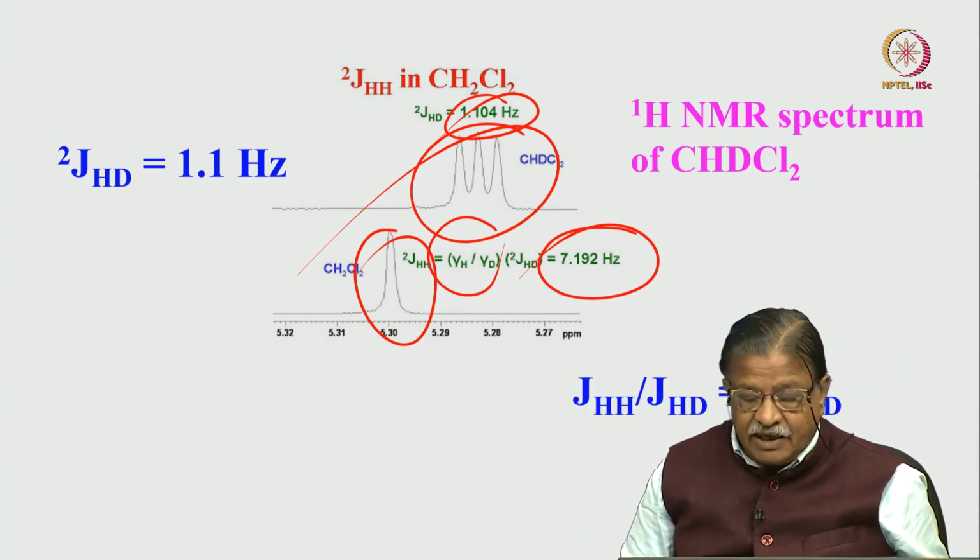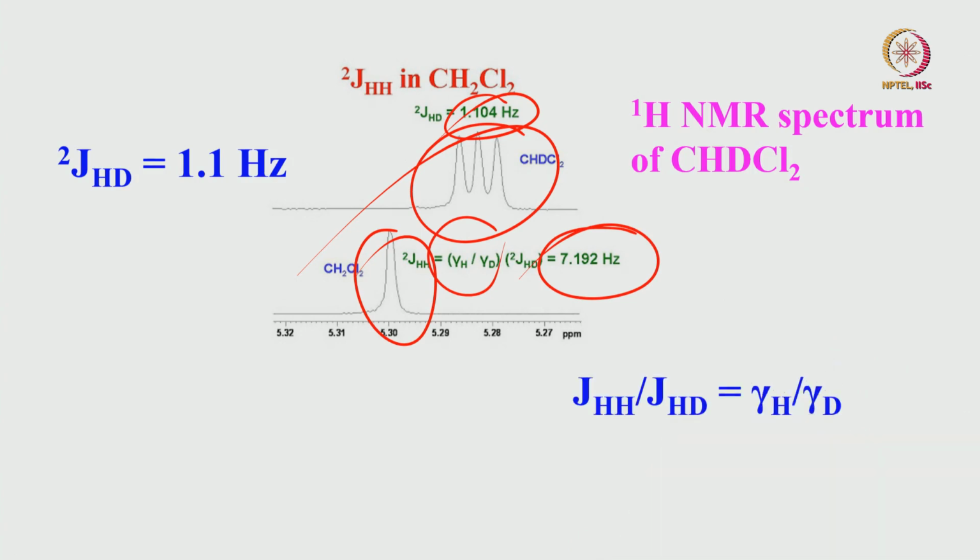Okay, this is what it is. In the magnetically equivalent spins, we know how to determine their couplings, even though the coupling is not reflected in the spectrum. All you have to do is the isotopic substitution. Whereas in molecules like benzene and others, you have to break the symmetry by taking into account carbon 13. Then you will get HH coupling. That is how we could get all the information.